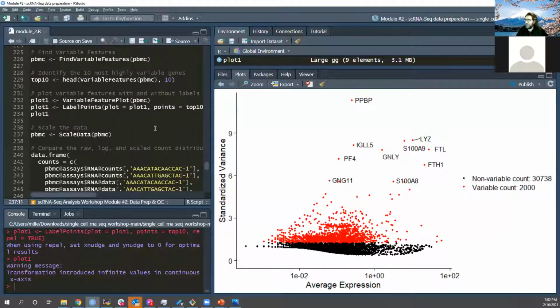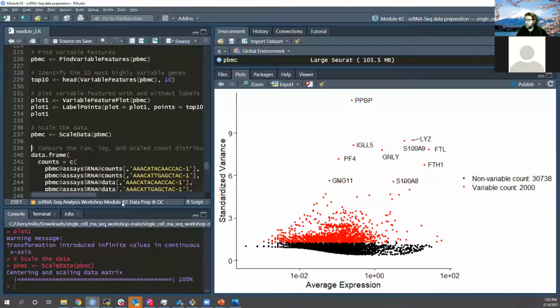I think they have some slight alteration on that in this context, but in essence, that's what we're doing here. The point of that is that when you want to do anything like principal component analysis, you have to have centered and scaled data. Centered meaning that the mean is 0. So there we go. Now we have centered and scaled the data matrix.